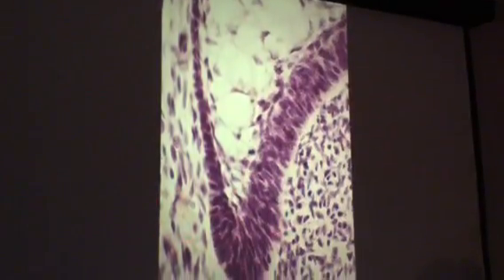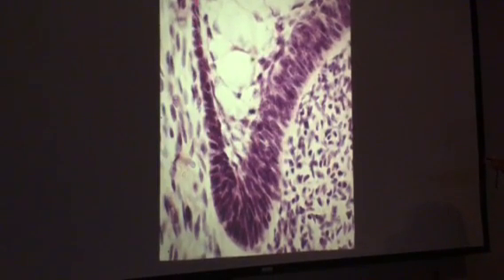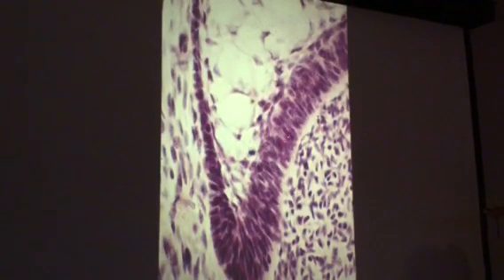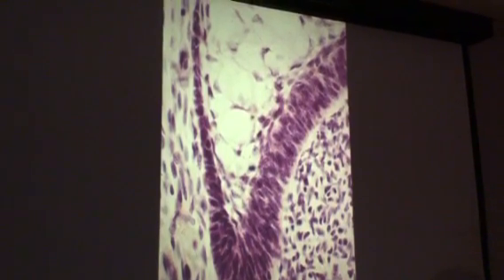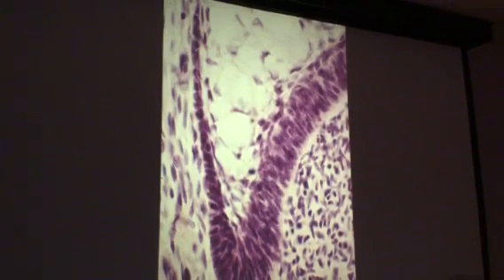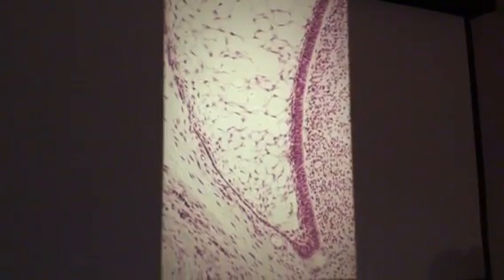And right here we have what? Cervical loop, and that would make these cells what? Outer enamel epithelium, and that would be inner enamel epithelium, and we're beginning to get some cells right there, and that would constitute what? Stratum intermedium, and these cells would be what? Stellate reticulum. Okay, well, same thing right there.